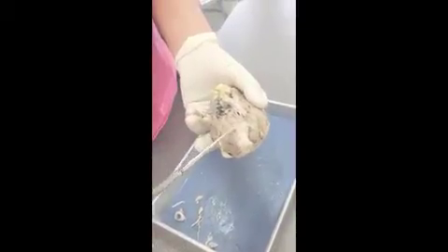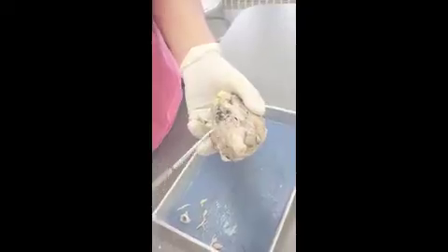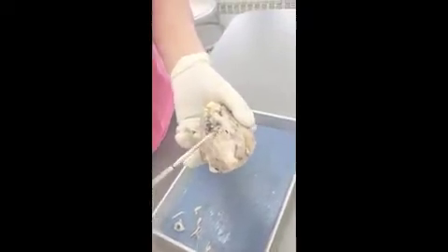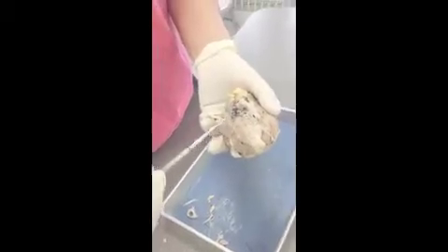Here we have the spinal cord, which transmits neural signals between the brain and the body reflexes. Then we have the medulla oblongata, which controls swallowing, breathing, and blood pressure. And then behind that is the pons, which helps with sleep, respiration, and hearing.